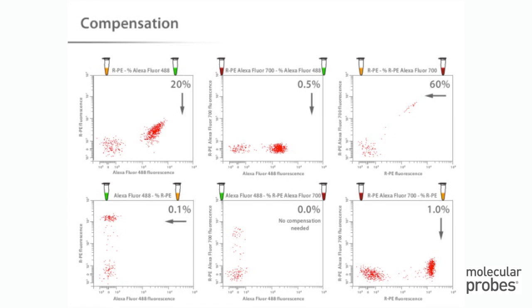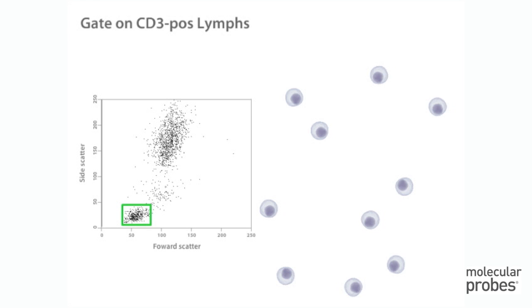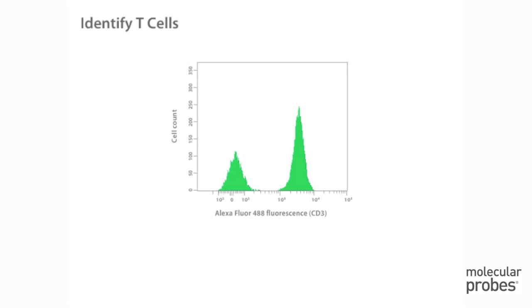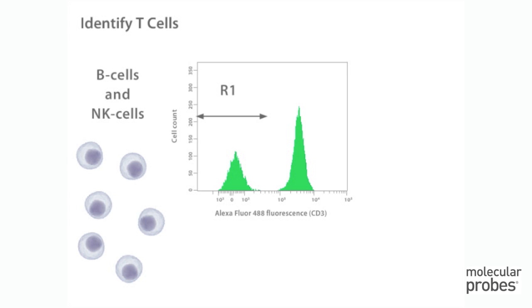All the other emission signals that show spectral overlap must be corrected in the same way. After setting compensation, we want to identify T cells from within the lymphocyte gate. One of the probes we use in our experiment — an Alexa Fluor 488 anti-CD3 antibody — is a specific marker for T cells. To see how many cells within the lymphocyte population have the CD3 cell surface antigen, we first create a log scale histogram of Alexa Fluor 488 fluorescence. Next, we will define regions to capture both visible populations: Region 1 (R1) has been set on the CD3 negative peak, which includes primarily B cells and natural killer cells. Region 2 (R2) has been set on the CD3 positive peak — these are the T cells of interest.